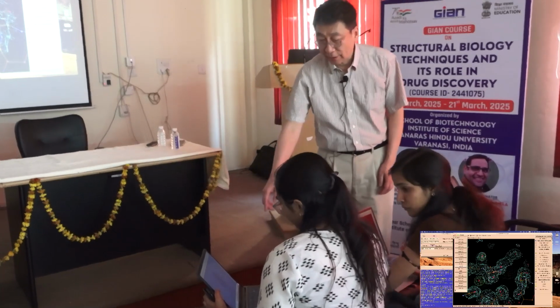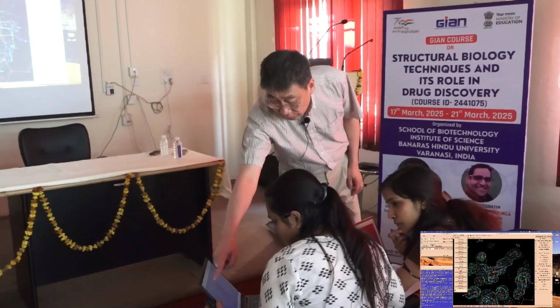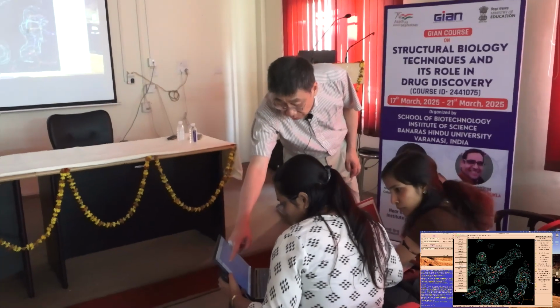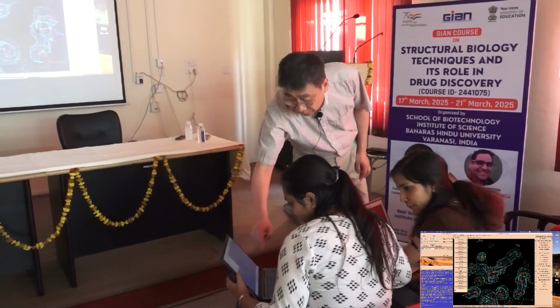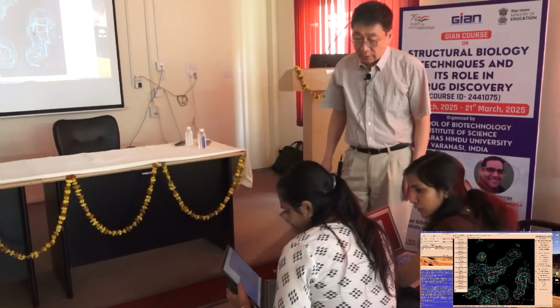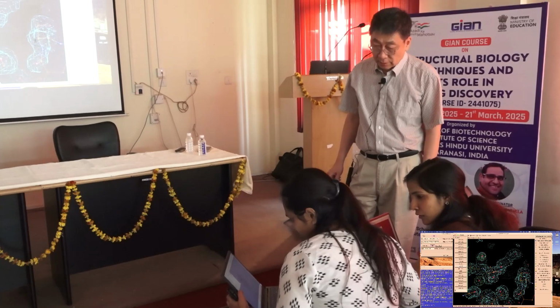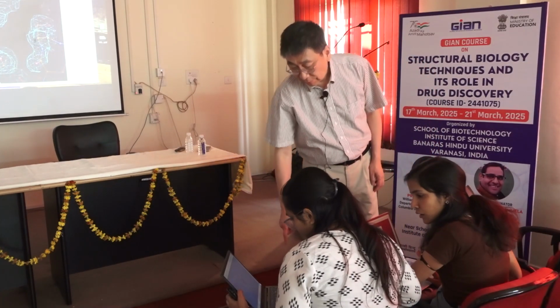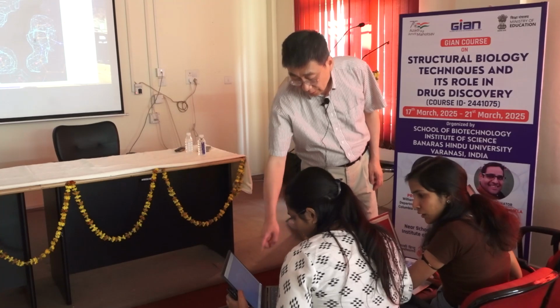And then the map radius is too big, so edit, map parameters. Yeah, make that 7. So the first number. Make that, no, yeah, make that 7. And say OK. And then spacebar. That gives you the residue 1.